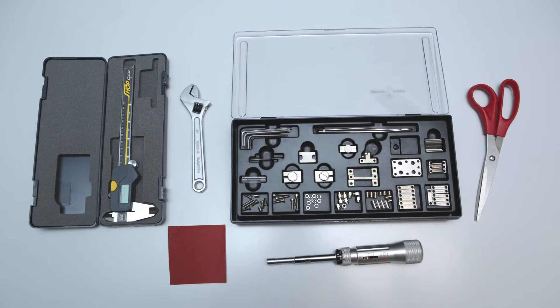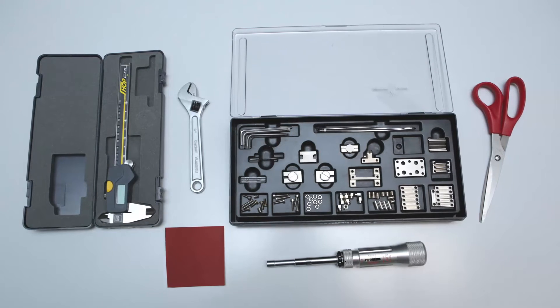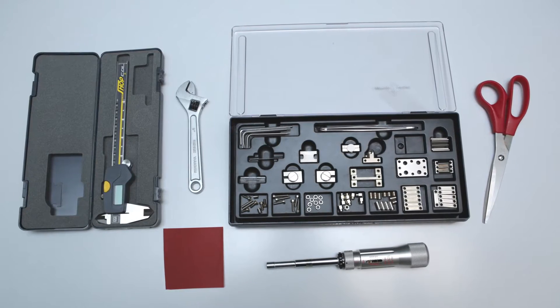The sample holders, clamps, clamping tools, and screws are stored in an accessory box that comes with a DMA.